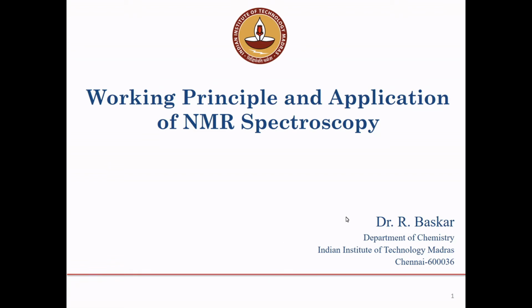So today I am going to discuss the working principle and application of NMR spectroscopy.